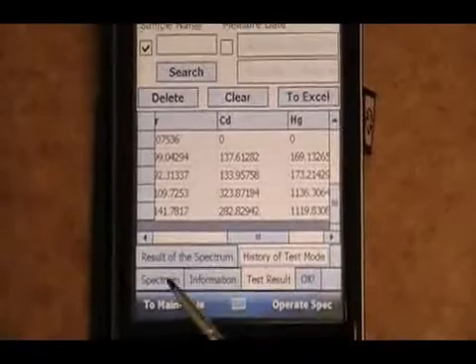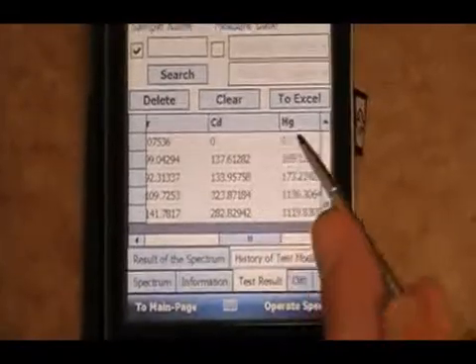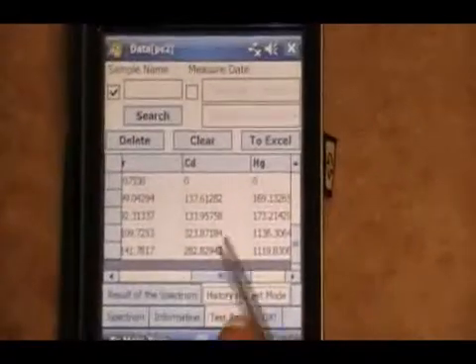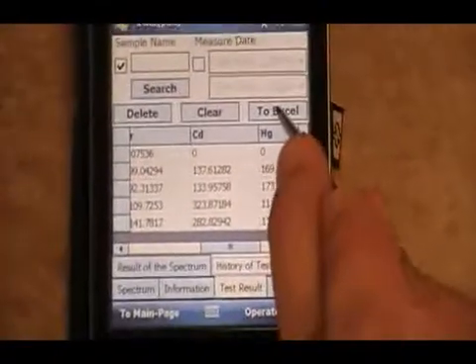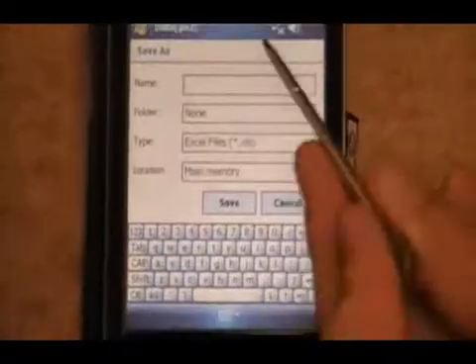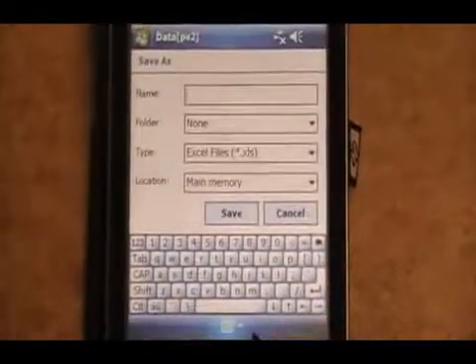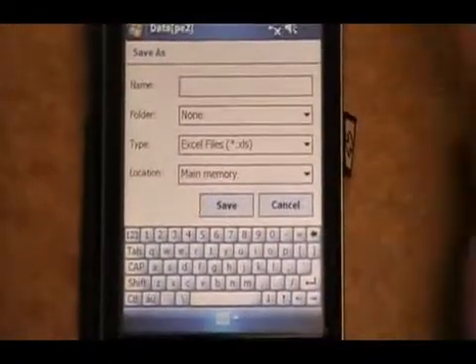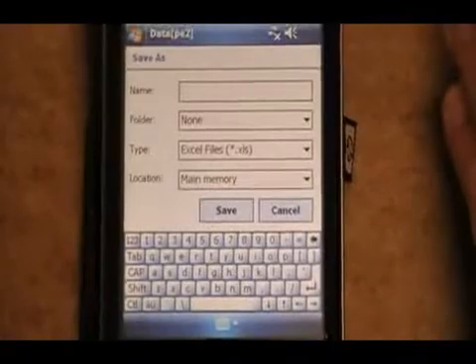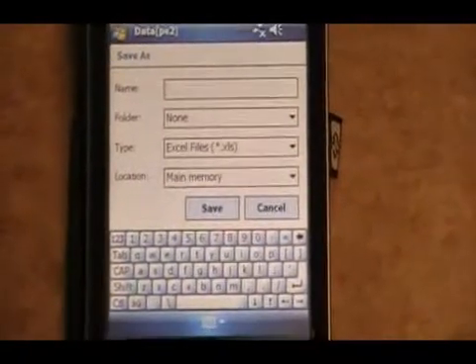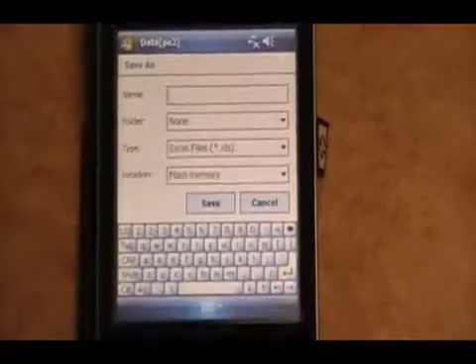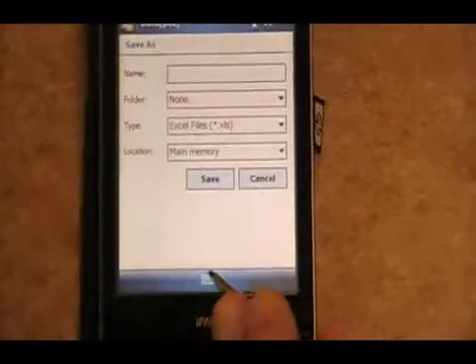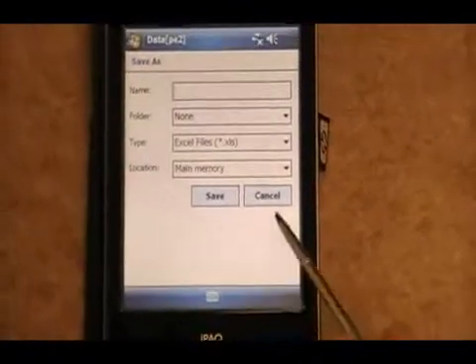In time, what we do is we'll take these numbers, click to Excel, and we can actually use this save as screen to save it to the SD card that comes with the unit and transfer it to a desktop for further data entry.